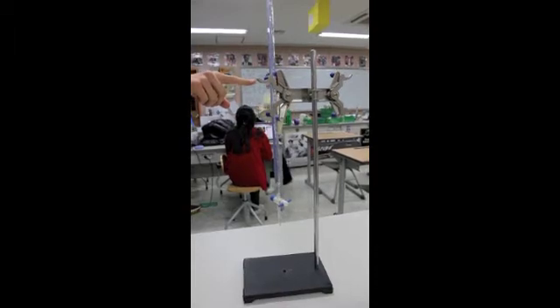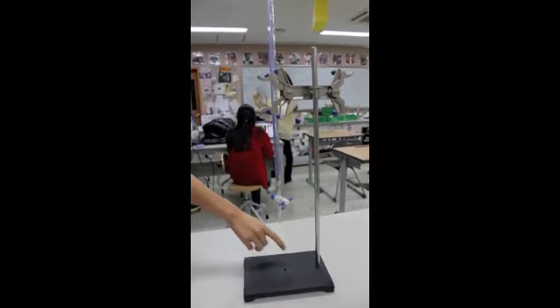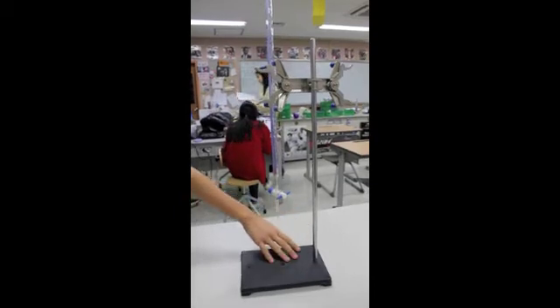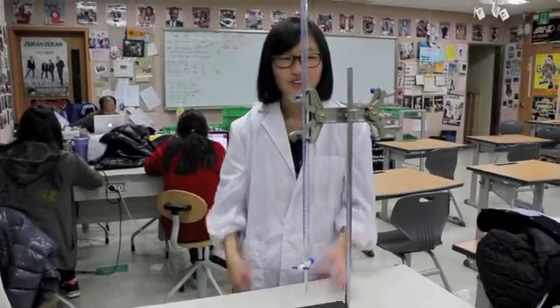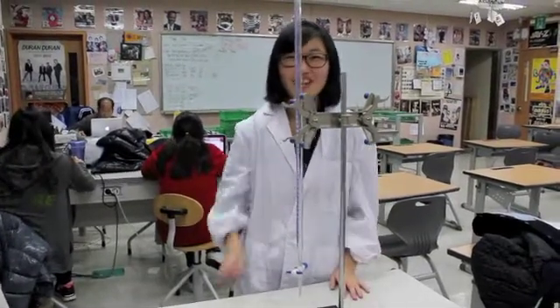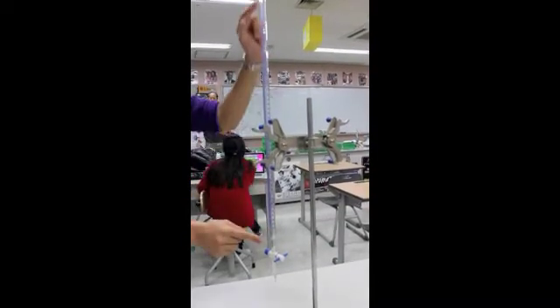Let's understand the parts. Here is the burette clamp. It will stabilize the burette itself. This is called the ringstand, and the Erlenmeyer flask will be placed here. Today we will be using the double ringstand, and this is the burette. The burette consists of the graduated glass tube and the stopcock.